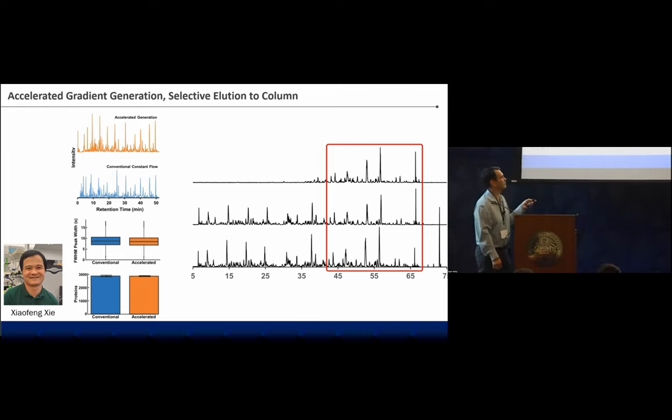And we're still keeping it at 20 nanoliters per minute. So this is the thing that we're going to be putting on the multi-column system next.